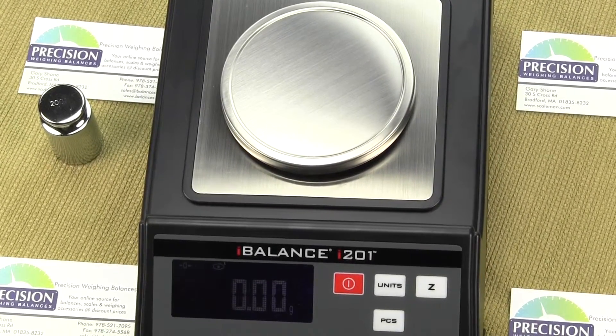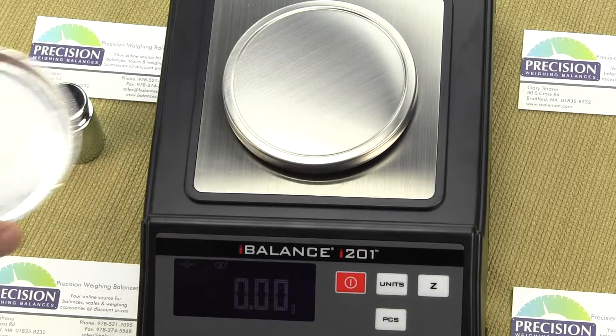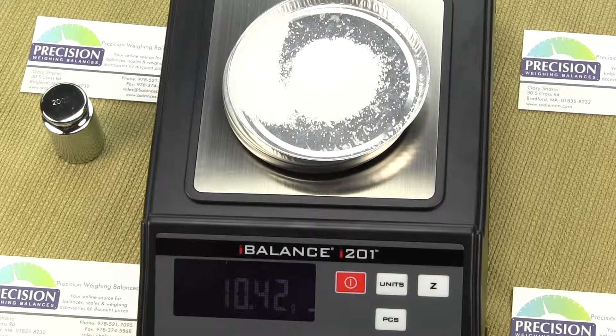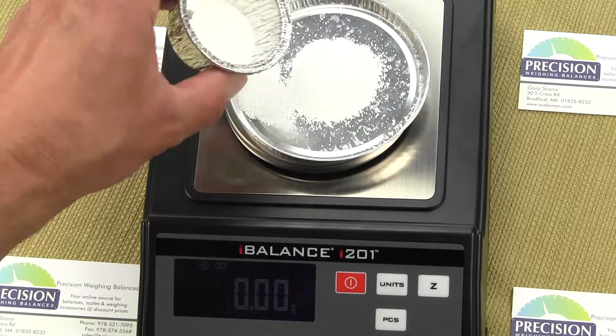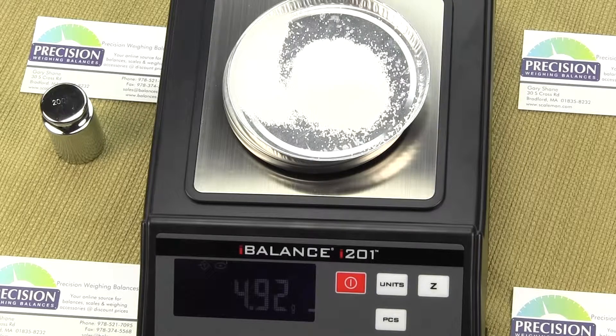Let's go through taring. If I have a container and I place it on the scale and I want to tare it out, I just hit the Z key — that tares the weight out of the balance. This balance goes to a hundredth of a gram. I've tared out the container, and if I want to add more material and know what the additional weight is, I can just sprinkle it on. The new additional weight is shown. You can tare to the full capacity of the scale, which is 200 grams.